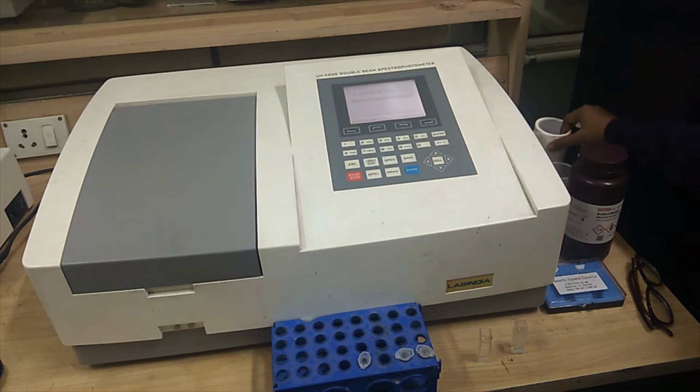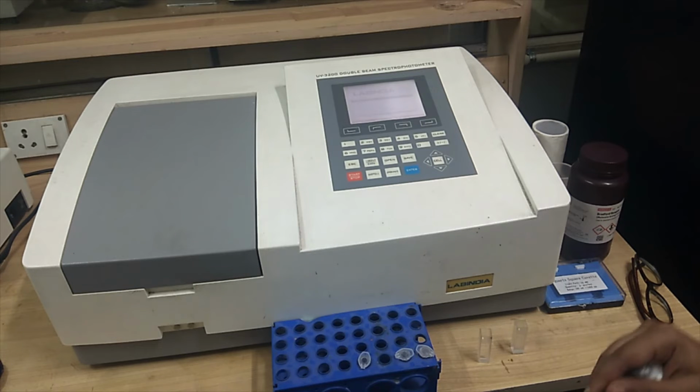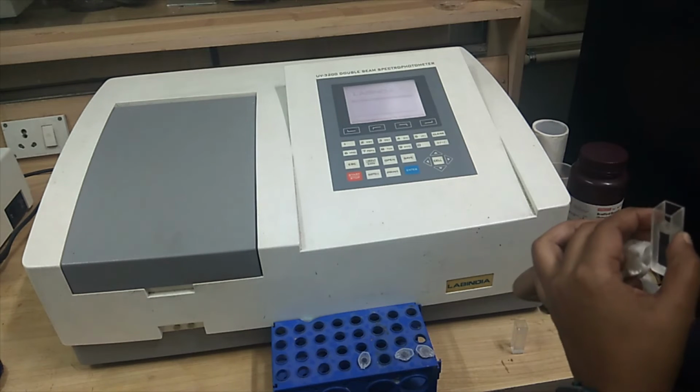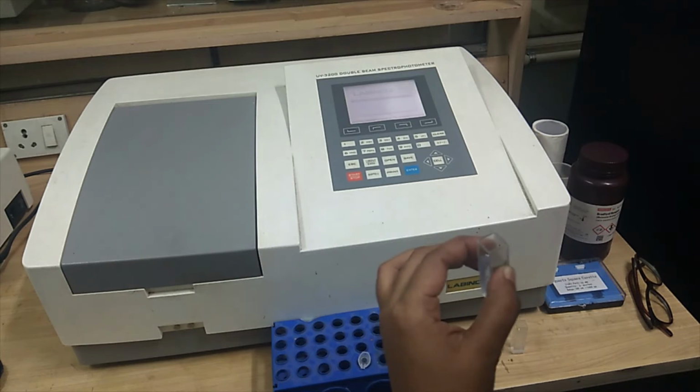We will start the experiment by doing a blank calibration. It is always advisable to use as blank the material in which your protein or sample is dissolved. Basically, it is always advisable to use the solvent of your sample as the blank. So here, since we have dissolved our protein in distilled water, we have kept our blank as distilled water.